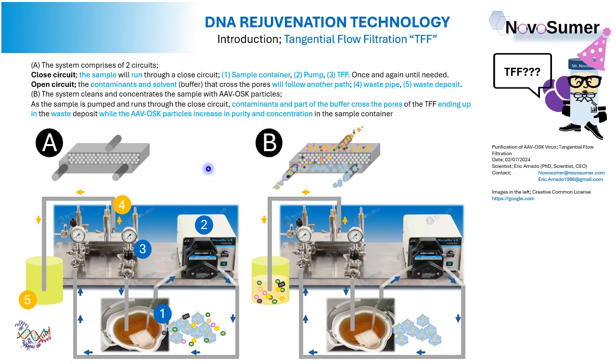Oh yeah, so here we are in the next slide. In here, we are going to see how the whole system works, how the TFF is integrated in the whole system. The system comprises two circuits, a closed circuit and an open circuit. Let's see both of them.